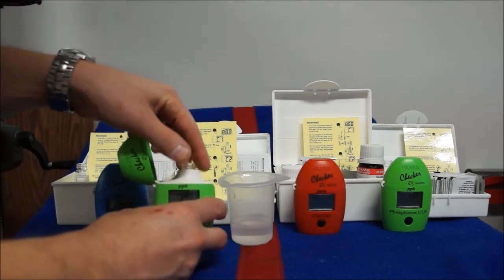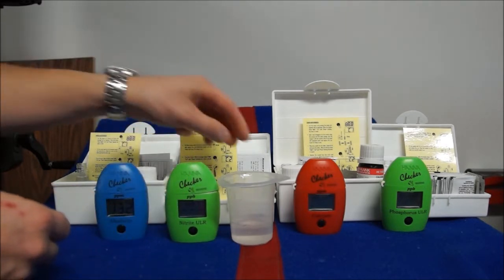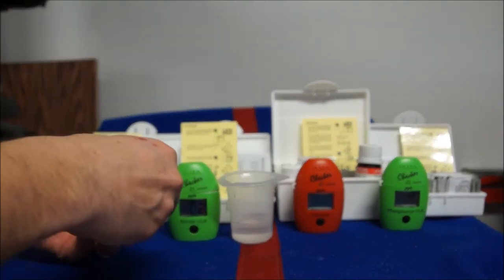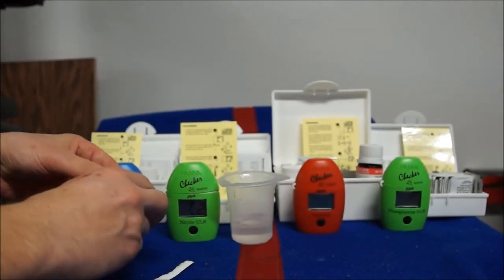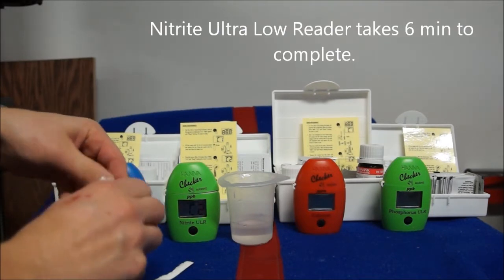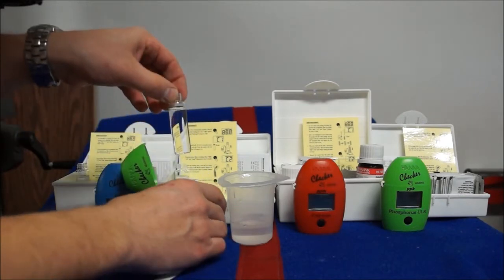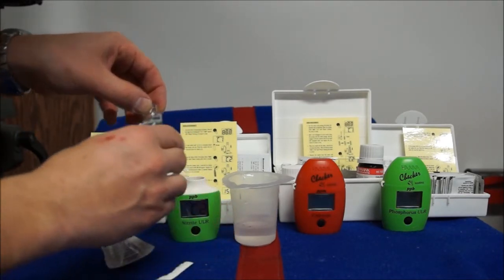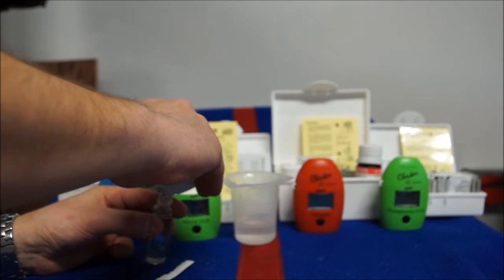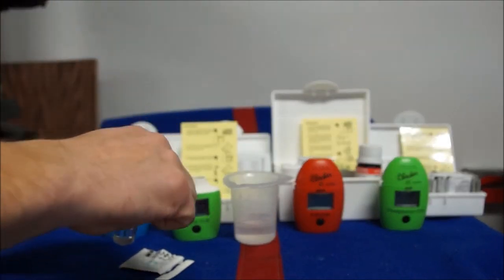You put your aquarium sample in and calibrate it. This one doesn't have a liquid reagent — it has a powder version. You have to make sure you get as much of that powder in there as you can. That powder will leave a residue when you're done, so it's very important to rinse your vial out with RODI water afterwards and make sure your vials are nice and clean and air-dried before your next test. Dirty vials will give you false results because most of these Hanna checkers run by photocells. We're going to put the reagent into the vial of salt water, put the cap on and shake it vigorously.